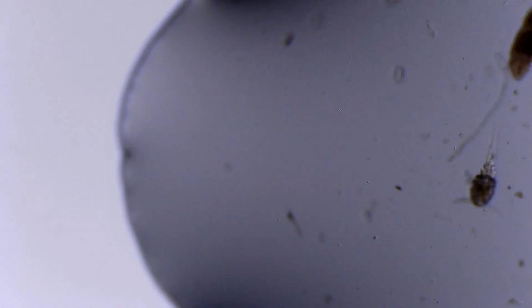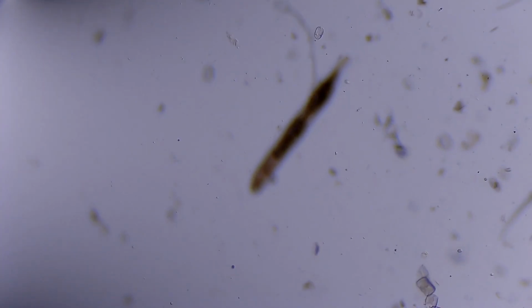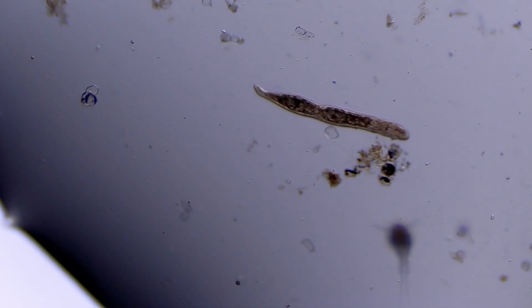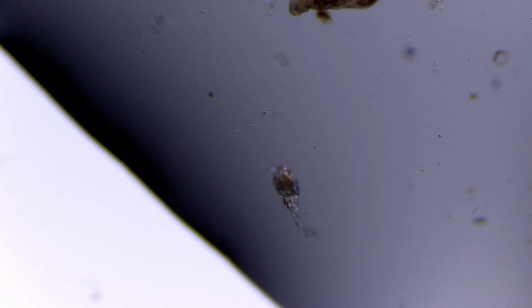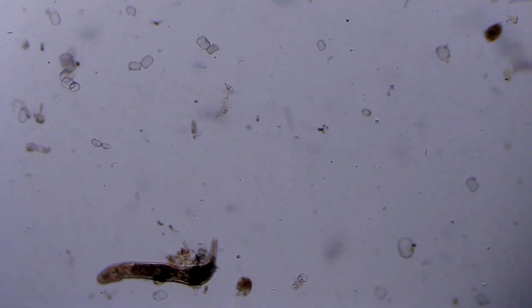Now, this droplet of water is really, really tiny. So that means the organisms in here are super tiny. When you look at it with the naked eye, all you can see is these tiny white specks just moving around. So you can barely see some of them with the naked eye, but they look like a little speck. I'm guessing this is some type of, I don't know, detritus worm. I don't even know if I'm pronouncing it right. Maybe it's planaria.